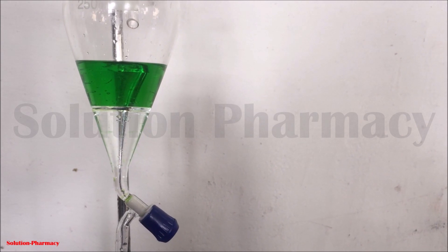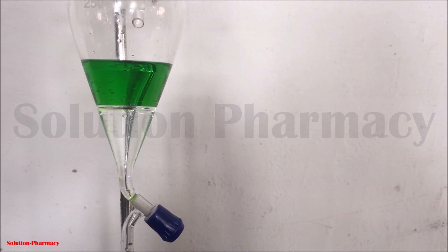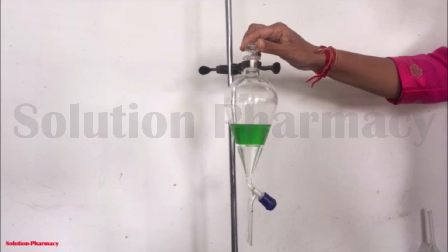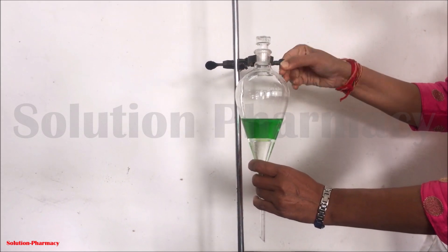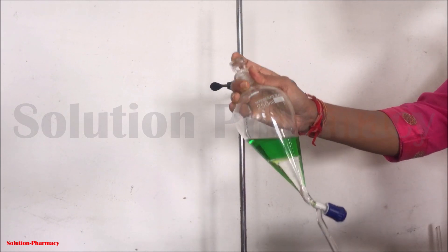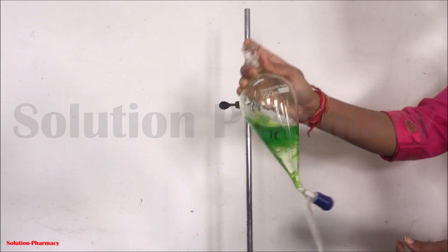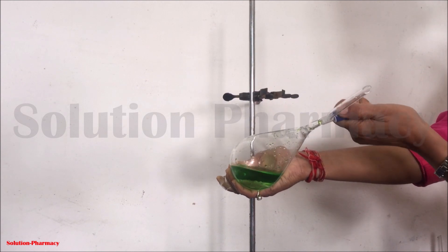In liquid-liquid extraction, we must not fill the separating funnel completely. Add the liquid sample in such a volume that there is sufficient space above the liquid inside the funnel for proper extraction. To start the extraction process, tightly close the separating funnel with the glass stopper, remove it from the clamp, and place your finger firmly over the stopper. Completely invert the separating funnel and return to normal position — repeat this two to three times.